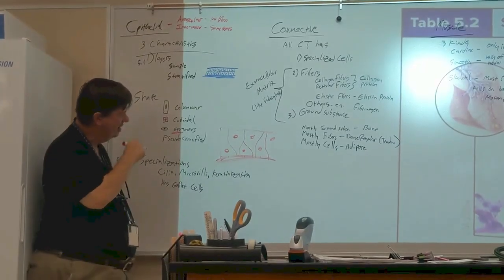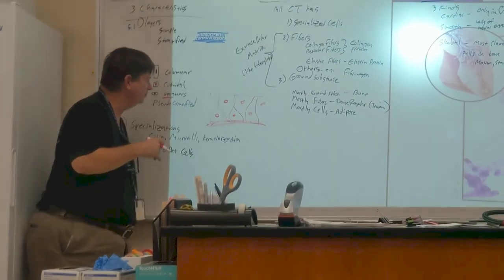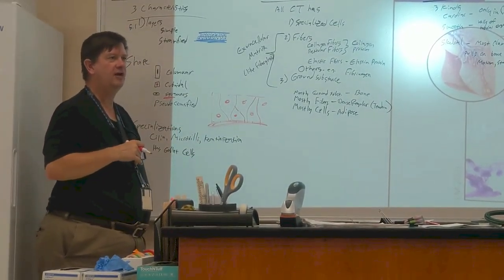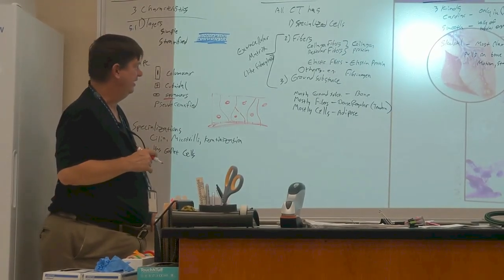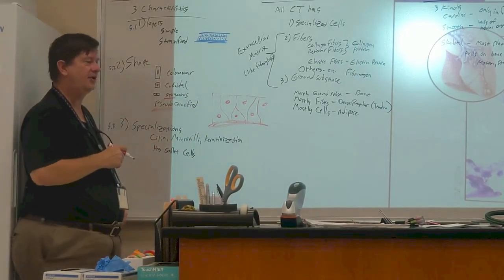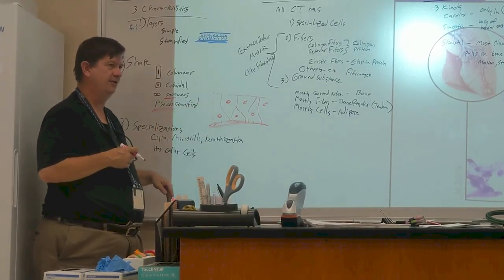Leland, if someone's bad at a microscope and they can't focus it, could you imagine a situation where they think there are 2 rows of cells because they see 2 rows of nuclei? Yeah. Okay. This is not stratified tissue, but it is pseudo-stratified. It's fake stratified. It looks kind of like it if you're not paying close attention, if you're not focused enough to see the membranes.